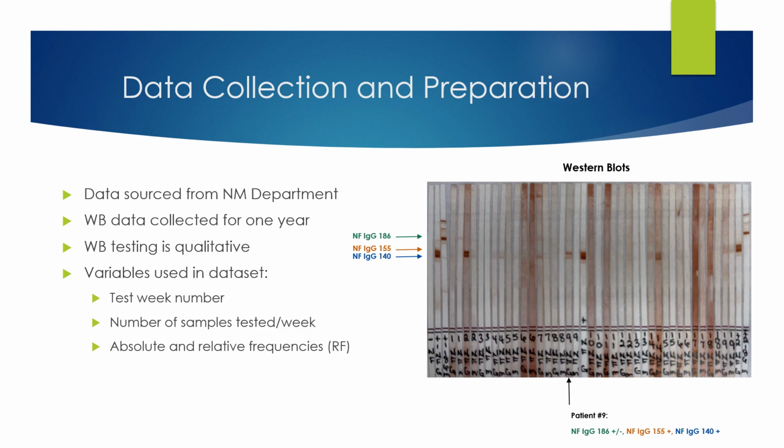Western blots are a qualitative immunoassay. Bands are detected, and they can range from very dark to barely noticeable. We use ratings on a scale of plus, or plus minus for how dark a band is. We sometimes use minus plus for a barely noticeable band.